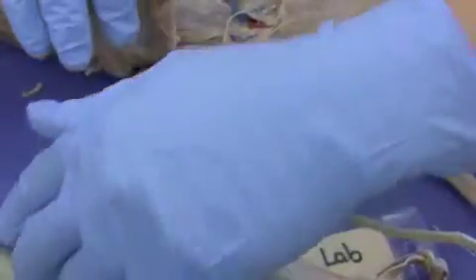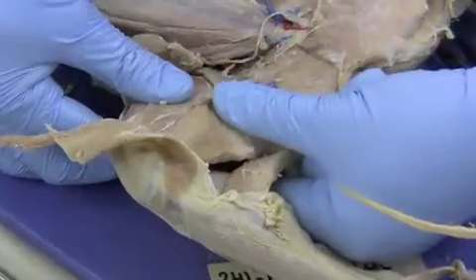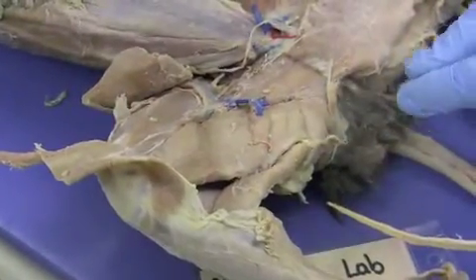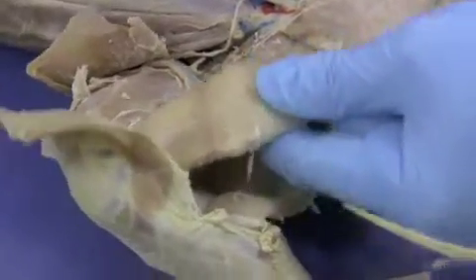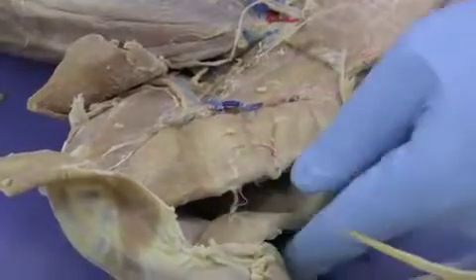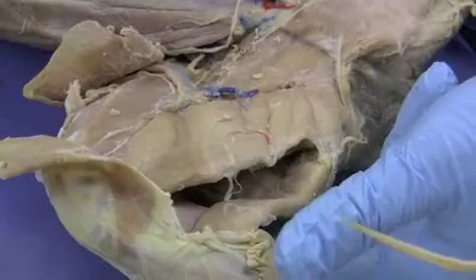Once those are both transected, you can see more muscles. These muscles on this part are the front of the thigh. These are the muscles on the back of the thigh. The muscles on the back of the thigh are called the hamstrings, and they are made of three primary groups: the semimembranosus muscle, the semitendinosus muscle, and the biceps femoris, which we'll see when we flip the cat to the other side.